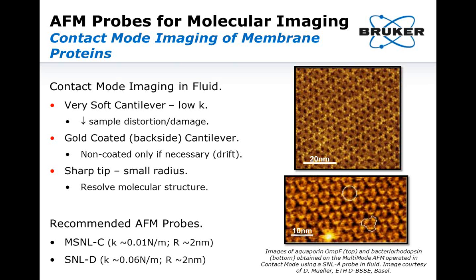Here we're looking at molecular imaging of biological samples, in this case aquaporin and bacteriorhodopsin, and in that we are interested in the molecular structure. We want to use a sharp probe with a small end radius.